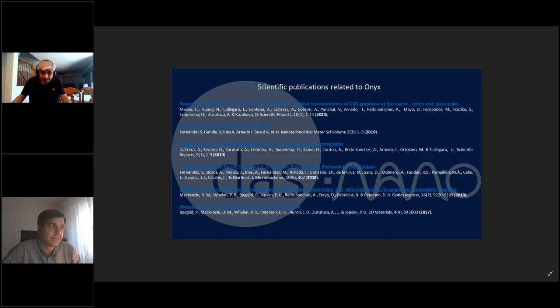How does the ONYX measurement result compare with the traditional 4-probe technique? Is there a standard sample for comparison? As you have seen in the presentation, we have compared with a modified version of Van der Pauw.